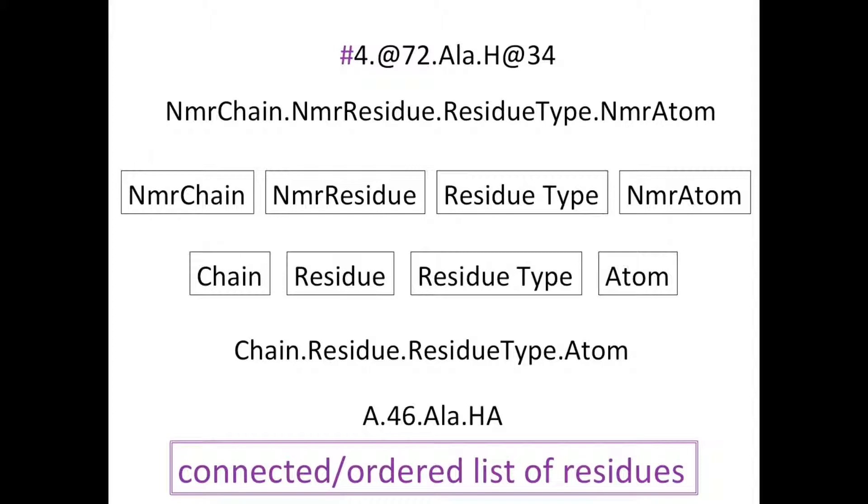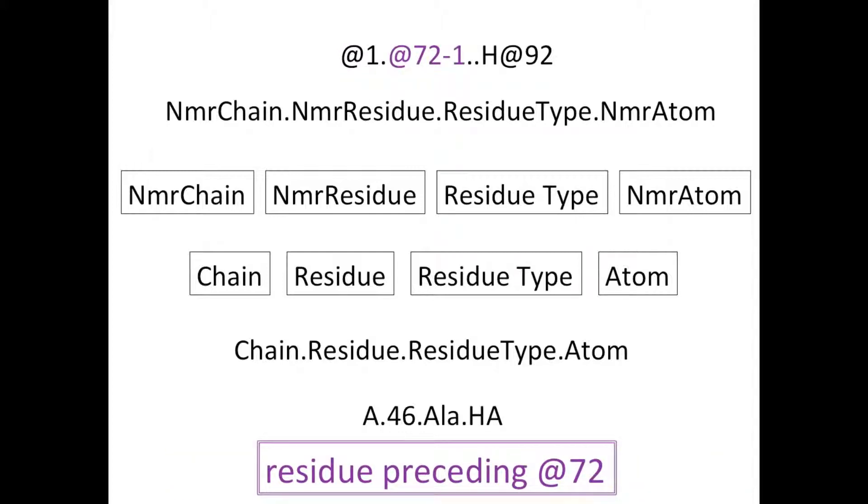A hash refers to a connected or ordered list of residues. So if you are able to link your NMR residues based on your spectral information, they would be placed in an NMR chain beginning with a hash. Finally, you can denote an NMR residue as preceding another one by adding minus 1 to it. It is important to remember that the minus 1 designation is treated as a string, as text, and denotes a connection. It is not a numerical or mathematical link.